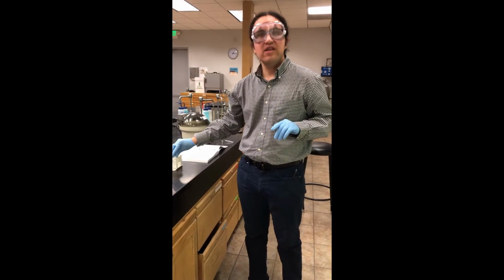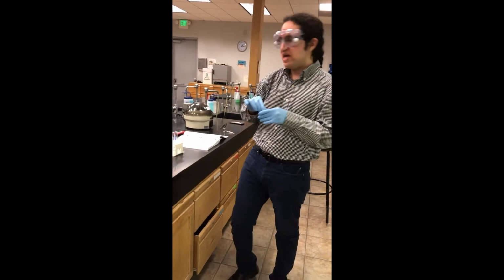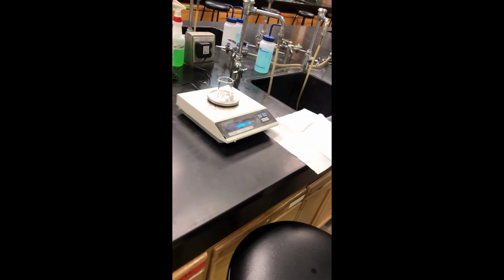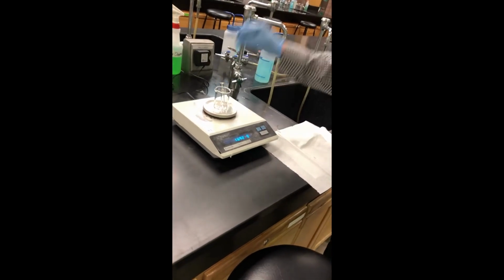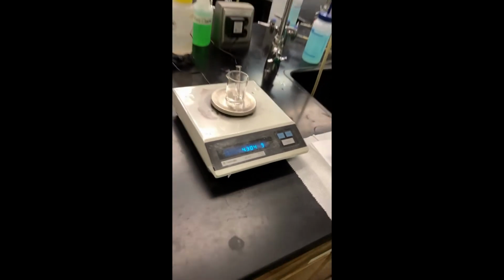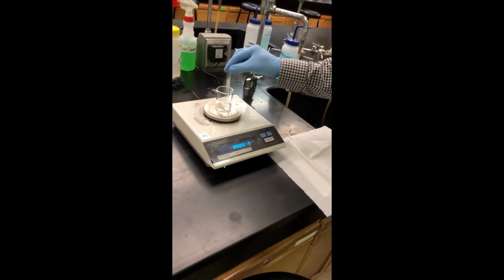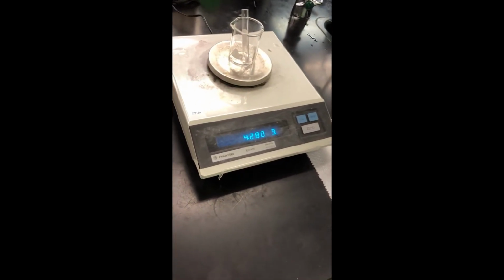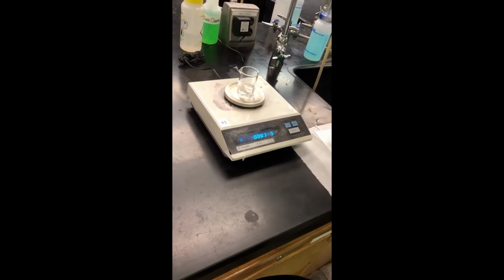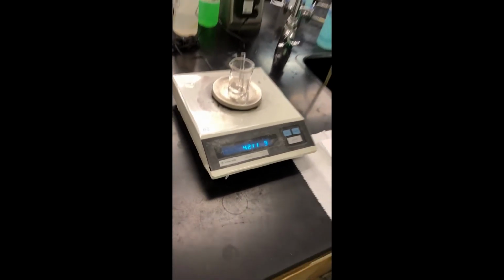Today we'll be doing the copper cycle experiment. So first things first, we need to take our 3 clean and dry test tubes. I have a tared beaker all set up, and we're going to record the mass of each of these empty test tubes. So here is test tube 1. Please take your mass reading. Next is test tube number 2. Please take your mass reading of the empty test tube. And here is test tube number 3. Please take your mass reading of the following empty test tube.